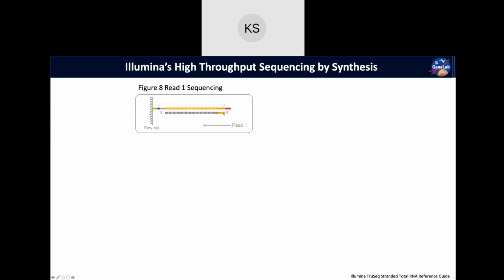complementary primer will be introduced. And so will, of course, polymerase as well as all of our labeled A, T, C, and Gs. So all of our labeled nucleotides. And so that will be primed here. And then we have polymerase that will latch on and start pulling in those nucleotides.